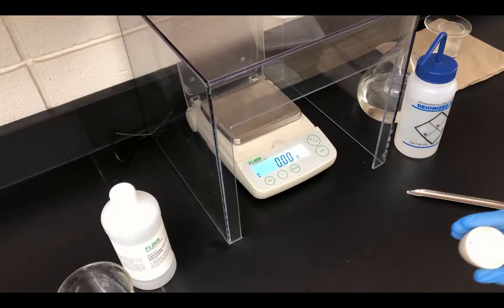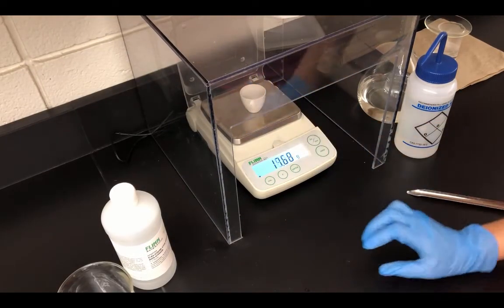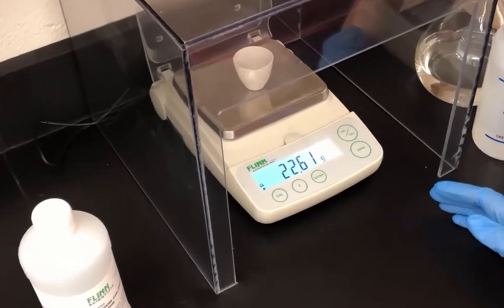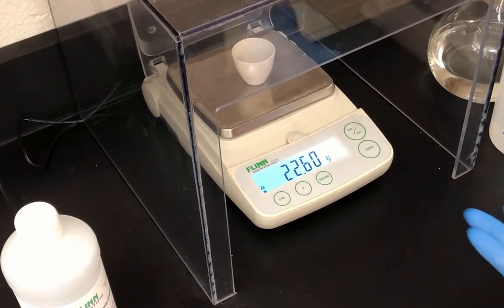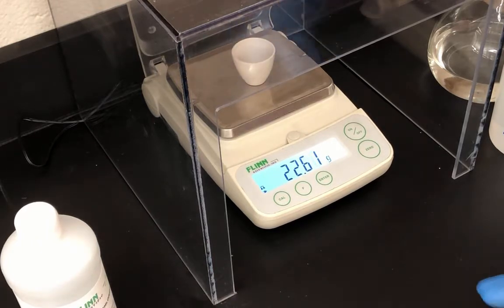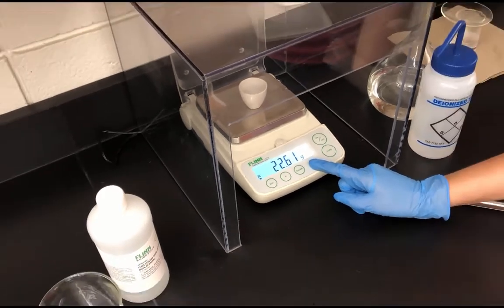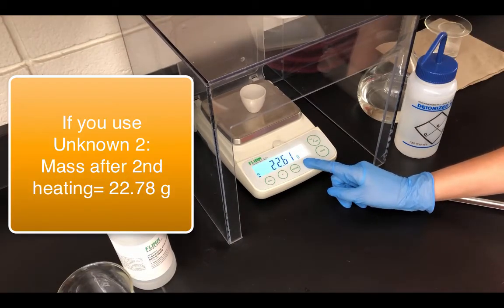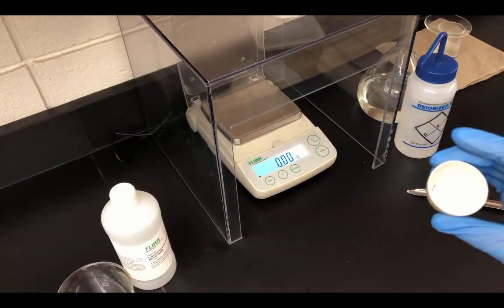So again, now that our crucible is cool to the touch, I'm going to go ahead and find the mass. And so the mass after the second heating is 22.61 grams. So again, in your data table, 22.61 grams is what you want to make sure to record.